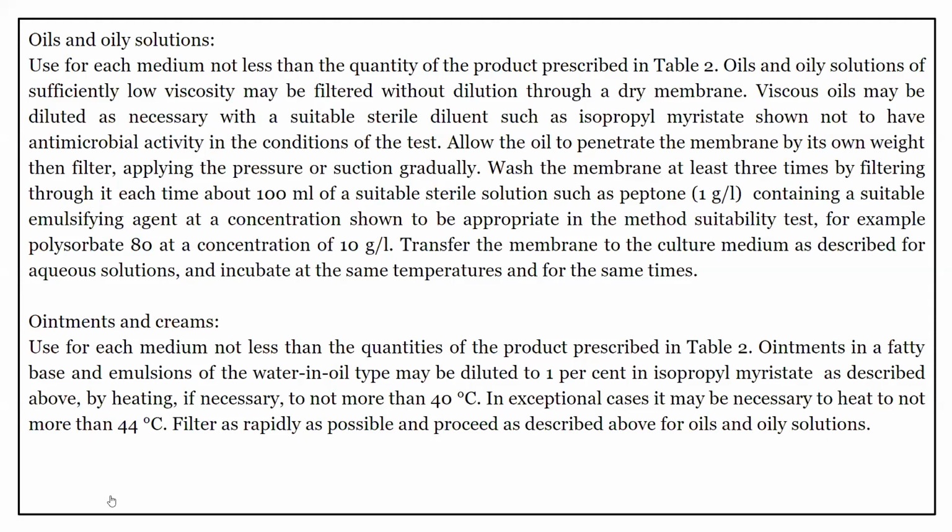So this says that if oils or oily solutions are to be tested for sterility testing, then if the viscosity is sufficiently low, you can directly filter oils or oily preparations through a dry membrane. Or if the formulation is viscous in nature, you can dilute it with an appropriate miscible solvent or diluent, provided that the diluent doesn't have its own antimicrobial activity.